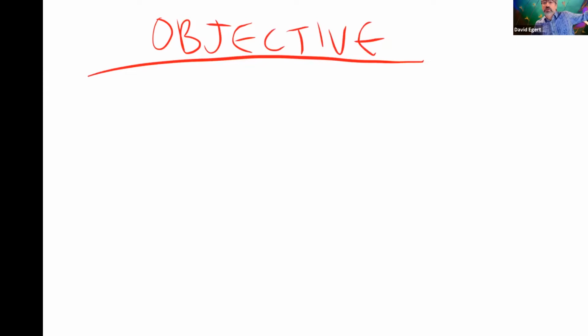So who would like to share their objective for today's lab? All right, Maria Portela. What is the correlation between the osmolarity of the solution and the type of solute, I wrote penetrating or not penetrating, and the osmosis inward or outward of the red blood cells? Right, so she's got 2 independent variables.